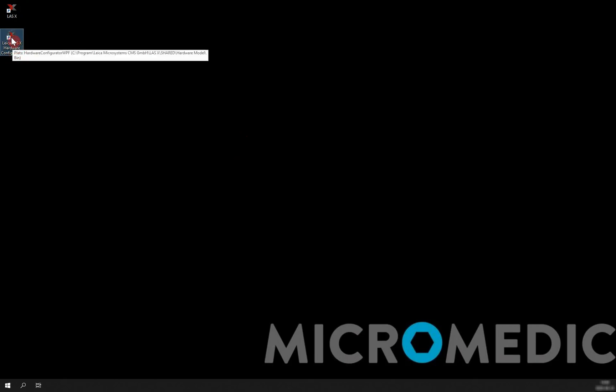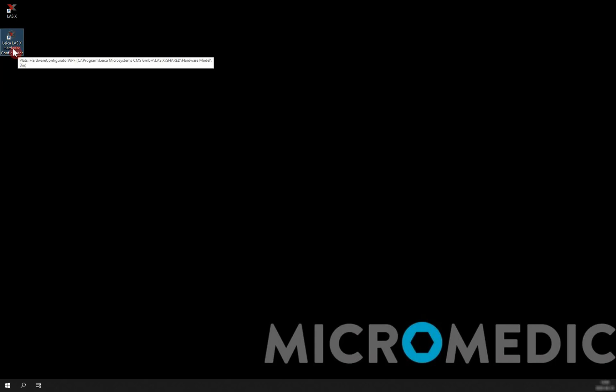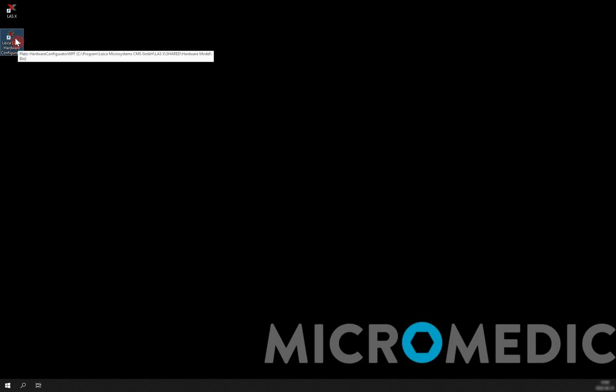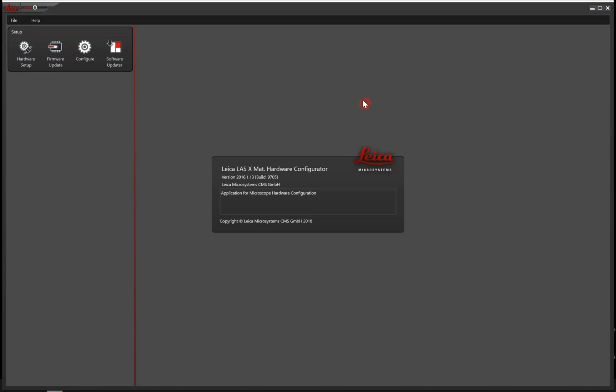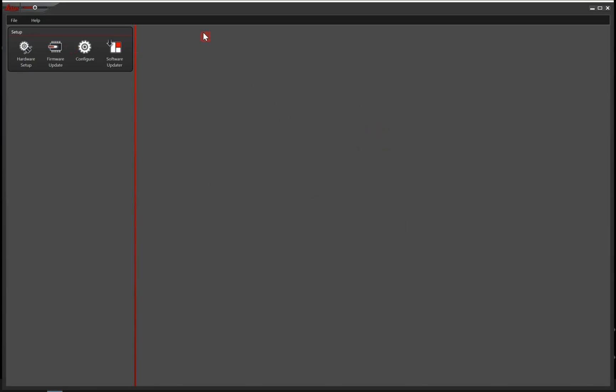And this we do in the LAS X hardware configurator, and its icon you see here. It should be on your desktop if you allow shortcuts during the installation stage, but if it's not, then you will find it through the Windows search bar or search tool.